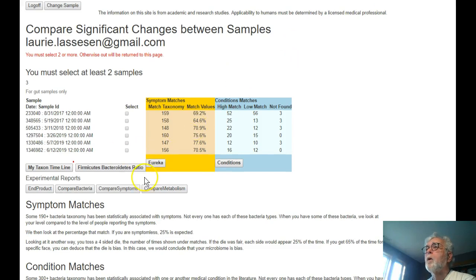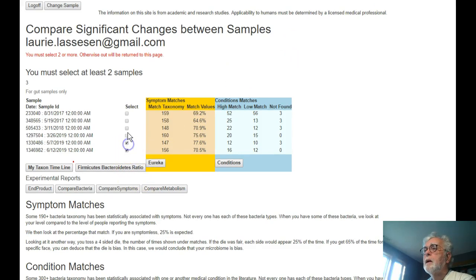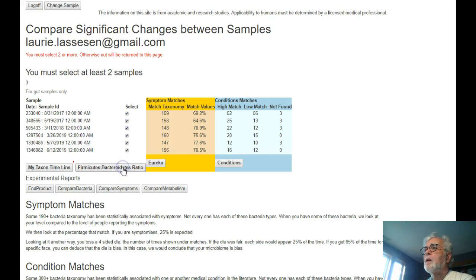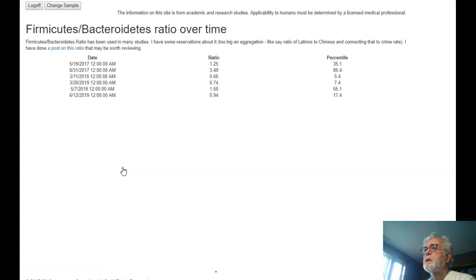So I will go back and correct that. I will select all of them and we'll proceed.